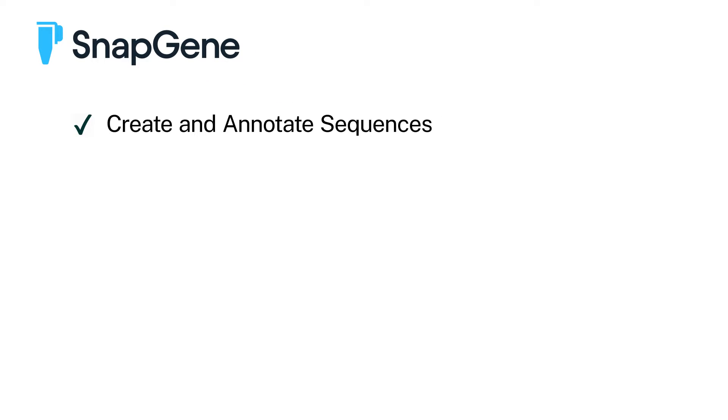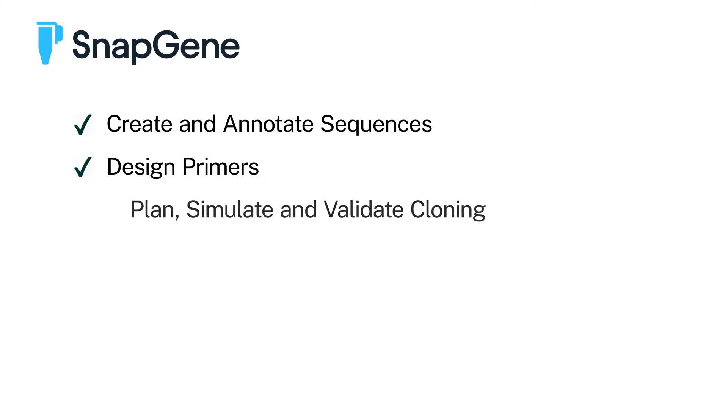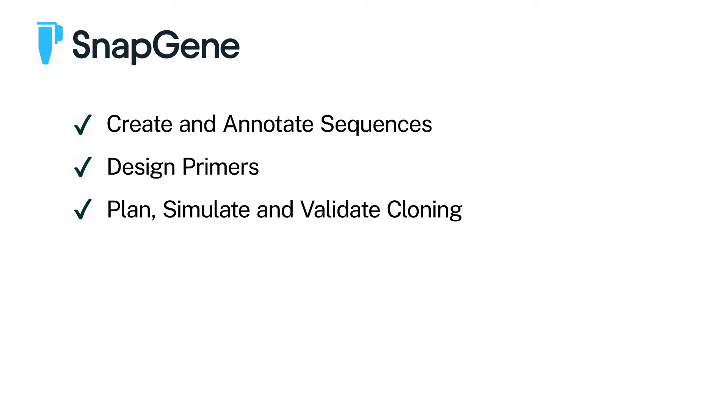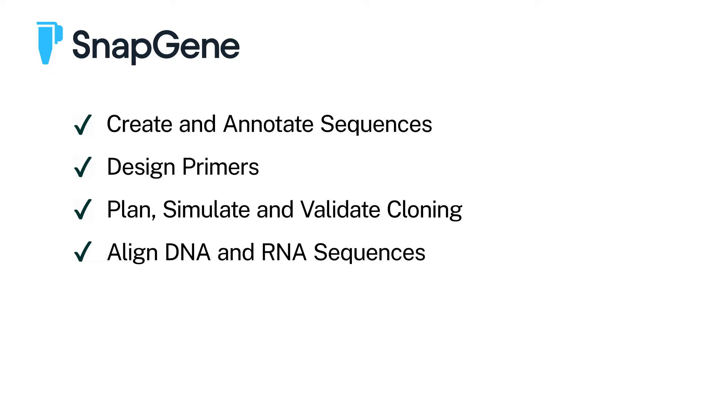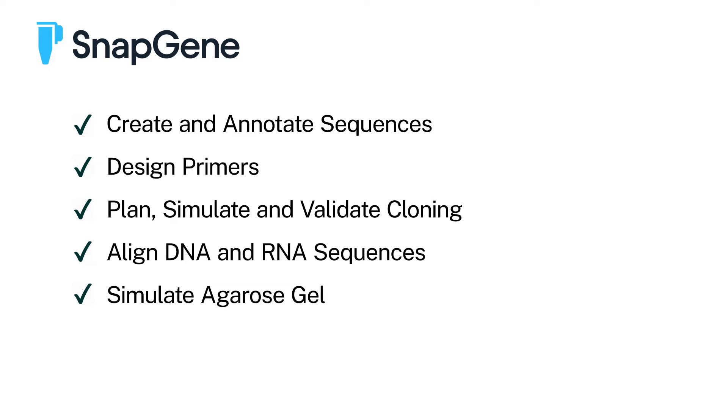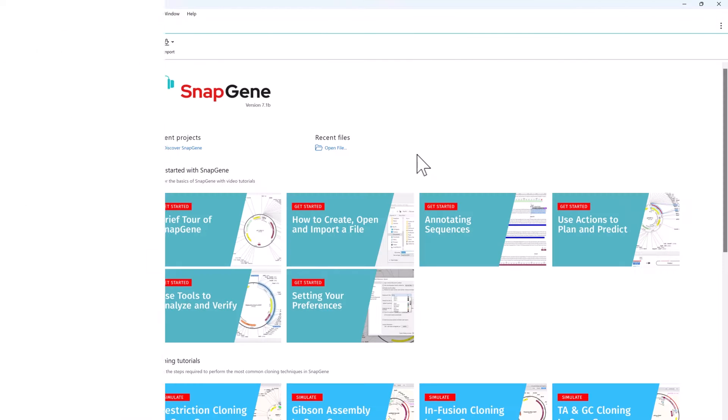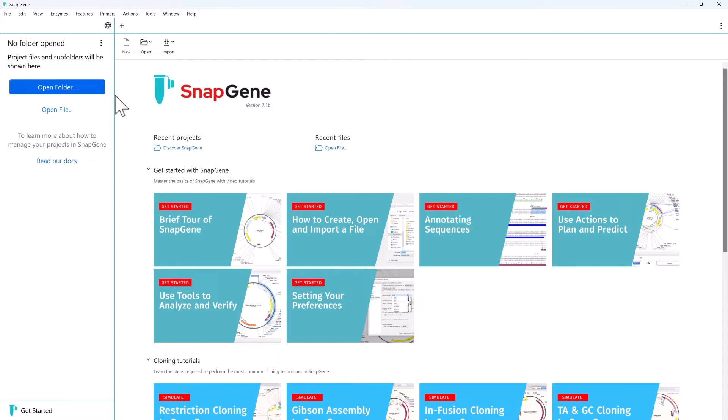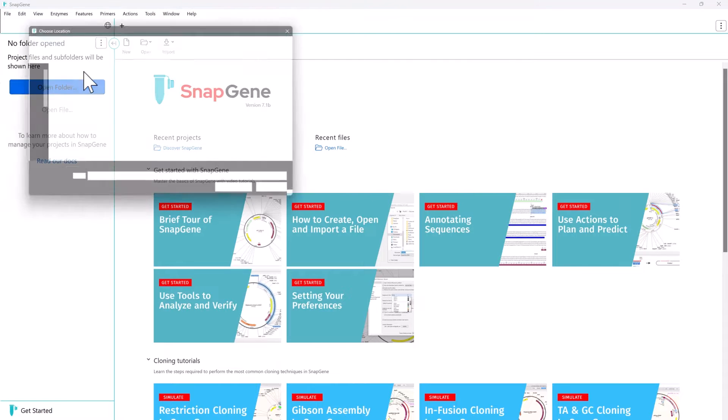With SnapGene you can create and annotate sequences, design primers, and plan, simulate, and validate cloning experiments. SnapGene can also align DNA or RNA sequences and simulate agarose gel electrophoresis. Let's demonstrate. You can define a folder as a project to manage and work with your files directly within SnapGene.